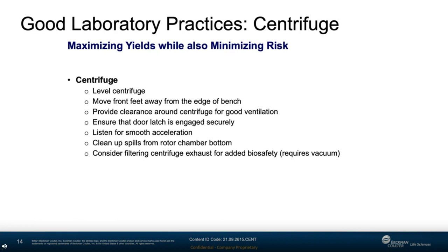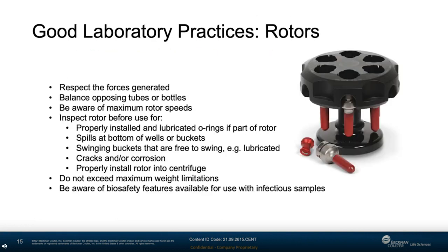The gravitational forces generated by a spinning rotor can range from around 1,000 to over 100,000 Gs. 1 mL of water weighs 1 gram at 1 G, but 10,000 grams at 10,000 Gs. As a result, imbalances are magnified, leading to imbalance being one of the biggest causes of accidents. Under these stresses, rotor materials, whether made of metal or carbon fiber, are stretched every time they are run.